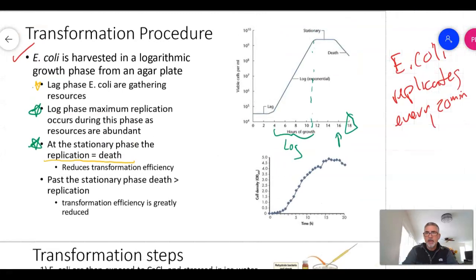And you can see, so this first graph on the top is what's predicted, and on the bottom, it's what's experimental, and you can see that it follows pretty closely, right? And they're looking at the optical density with a spectrophotometer. So it's about the same, right? It's about the same.